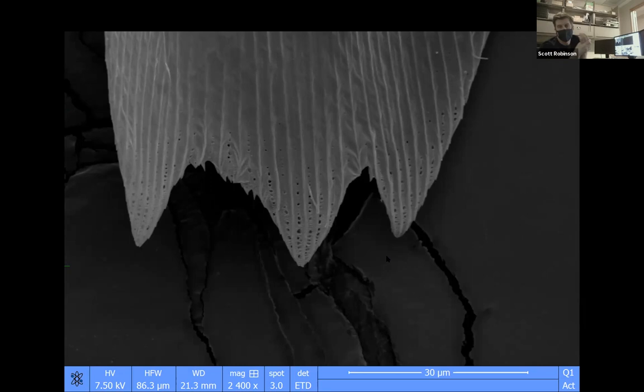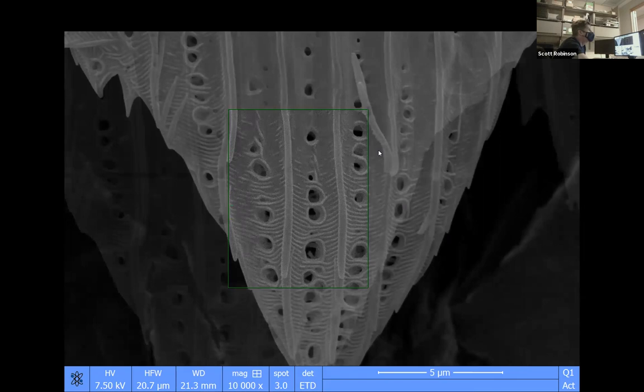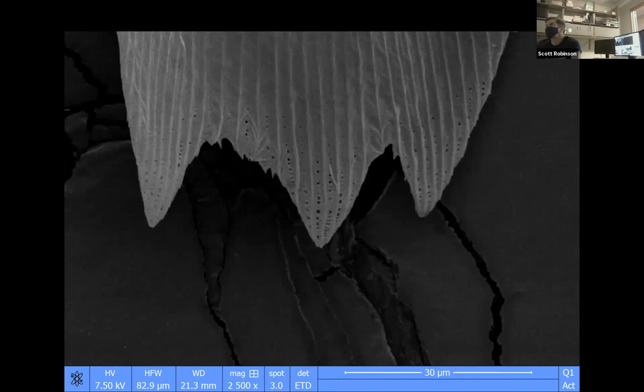I have a question that maybe might be a fun fact for people in the chat. What's the monetary value of the gold that you're covering the sample with? Is it negligible? Is it just so thin?